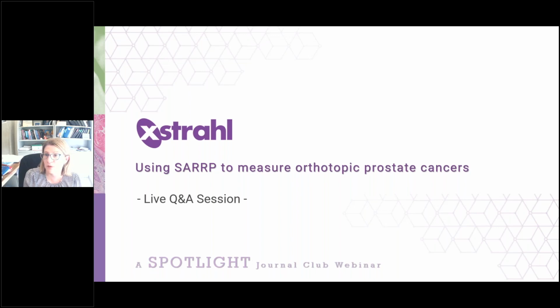So I think, if you have the ability to see the tissue well, like bladder, if you're looking at bladder cancer, I think this would work great because you can see the bladder really easily in these animals, and you can see that tumor. Again, like lung, I think this would work really well. You can really see a good contrast with the lung tissue. And so I think that would be a good modality.